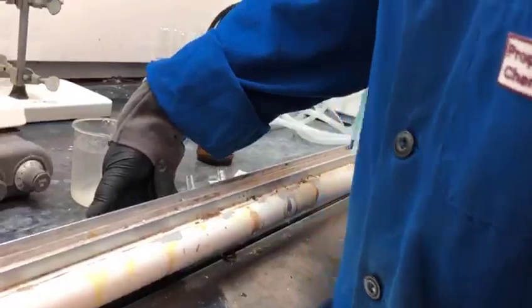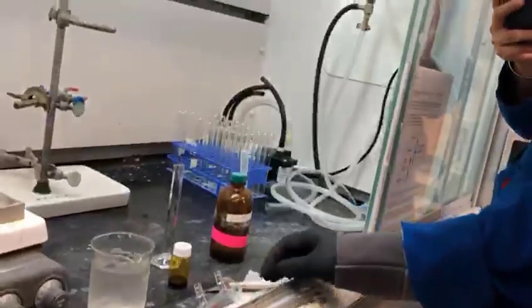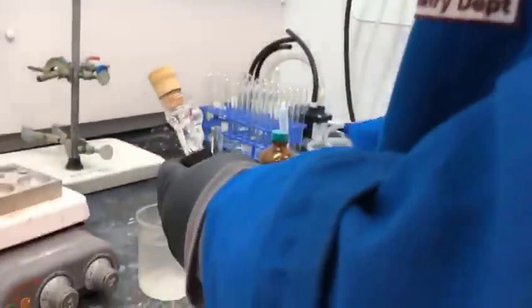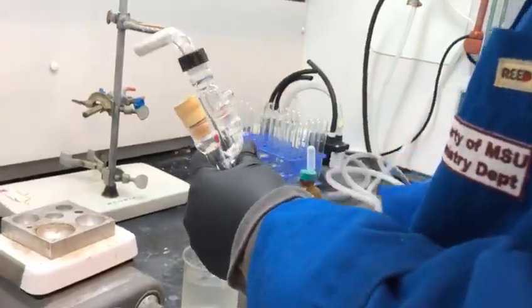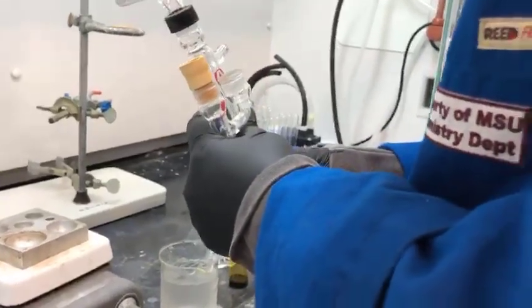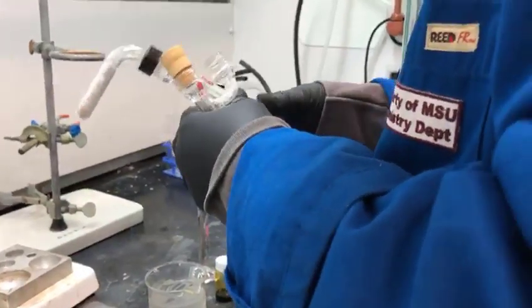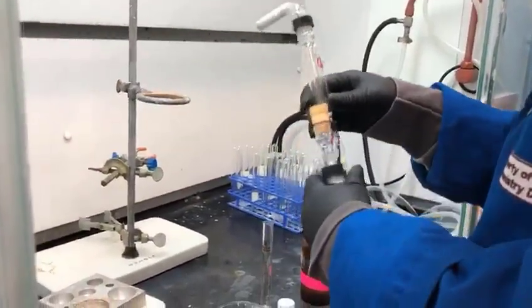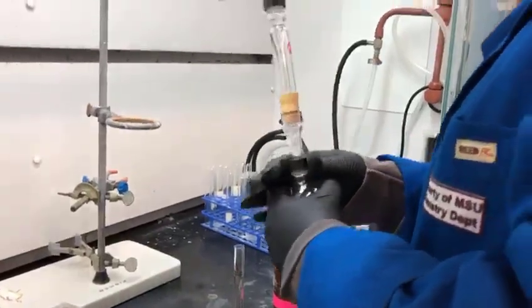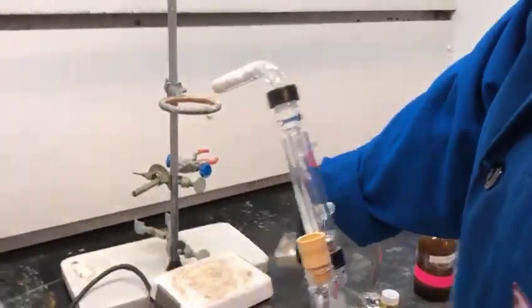Now you will also notice the glassware apparatus is being assembled. We have a round bottom flask with a Claisen adapter attached to it, and there is also a rubber septum already on the Claisen adapter. On the elbow arm that comes off the Claisen, you will see a condenser with a drying tube being added. All of this is going to be fixed onto our ring stand and then placed above our stir plate.